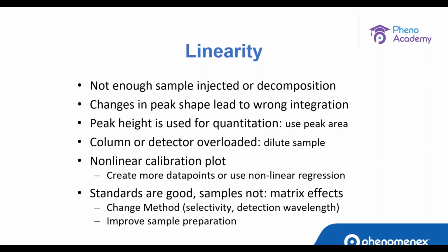Nonlinear calibration curve. In this case, we need to create more data points or use nonlinear regression.